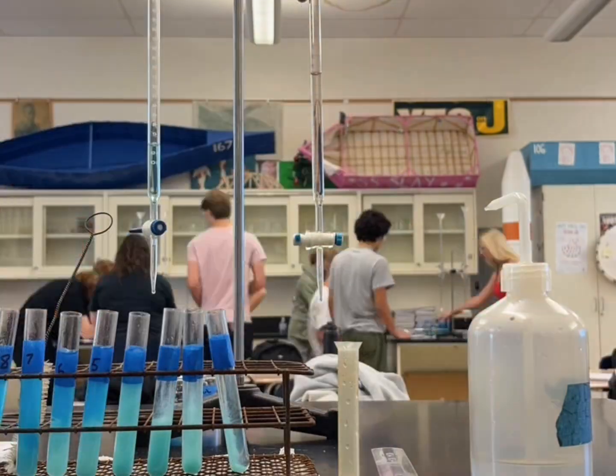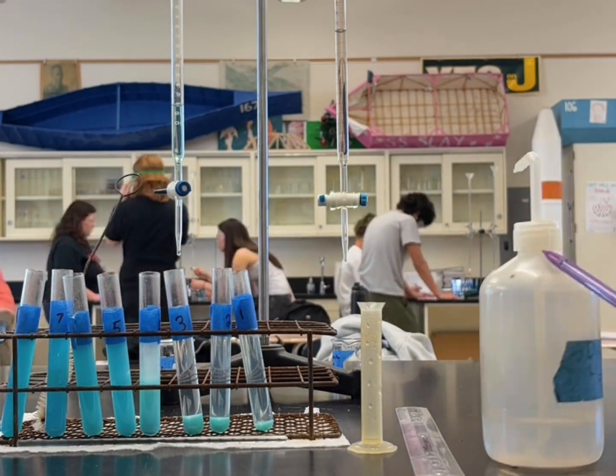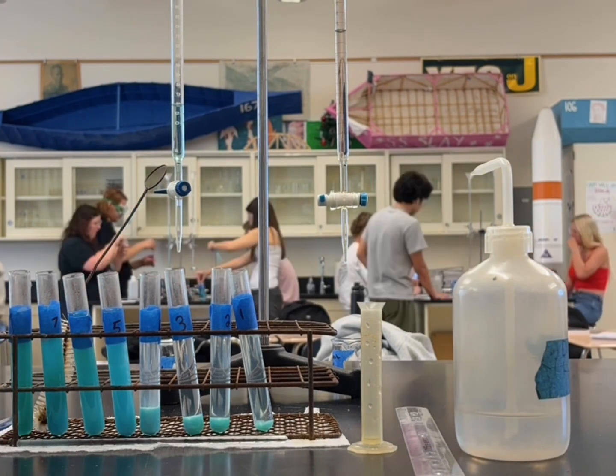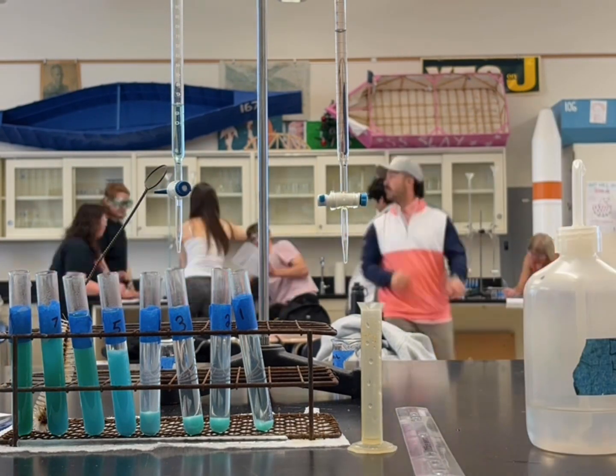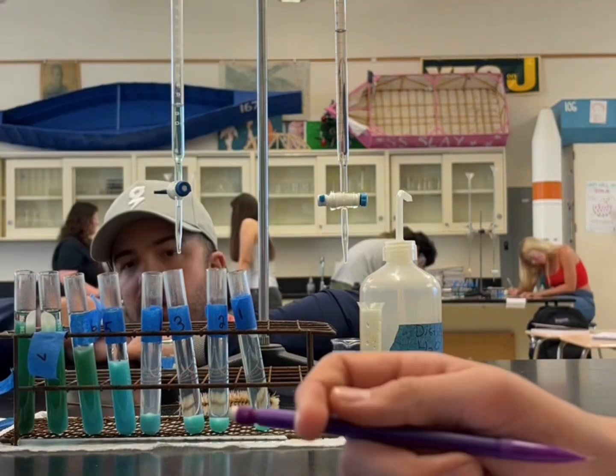We labeled 8 test tubes and added 5 milliliters of CuSO4 to each. In tubes 1 through 8, an increasing amount of KOH was added to each tube. We added enough distilled water to each tube for it to equal 13 milliliters. Once each test tube was filled, we waited for 15 minutes for the precipitate to form and a reaction to occur.